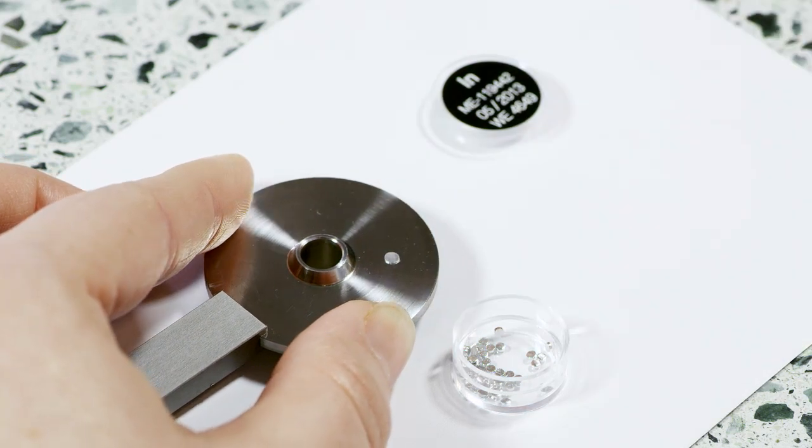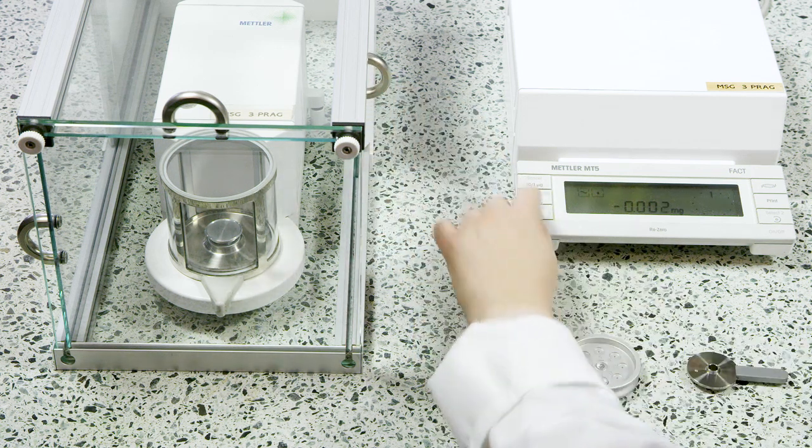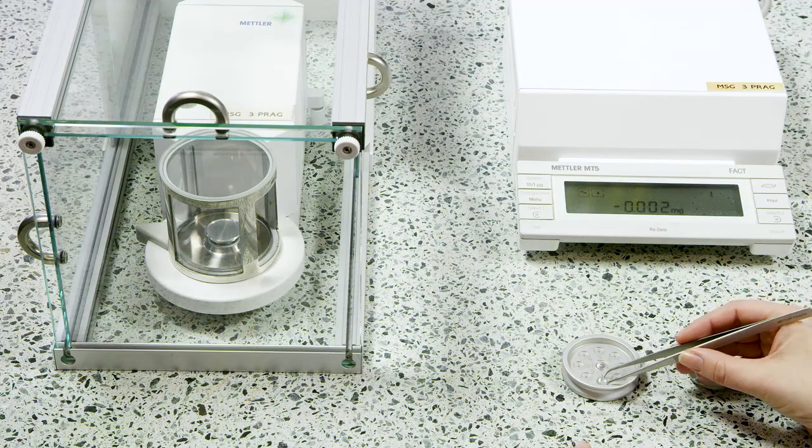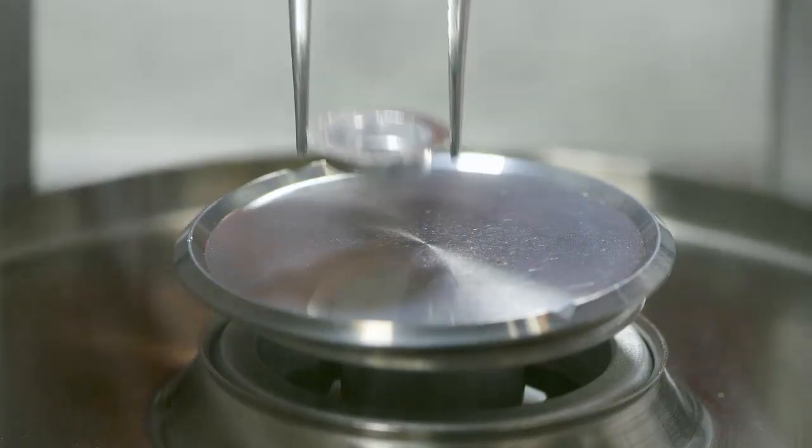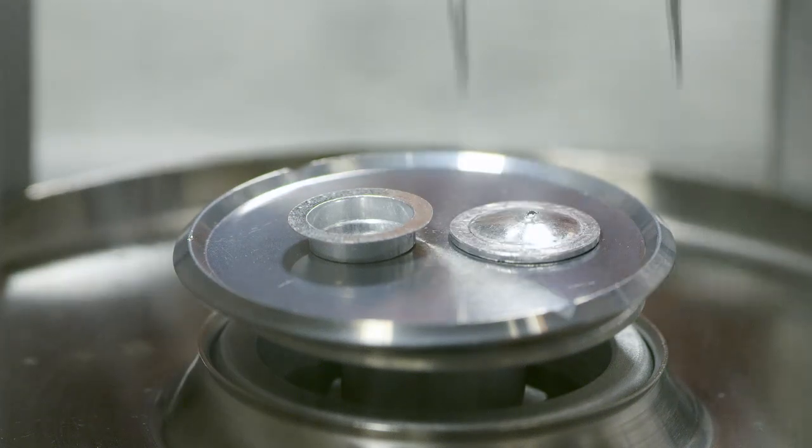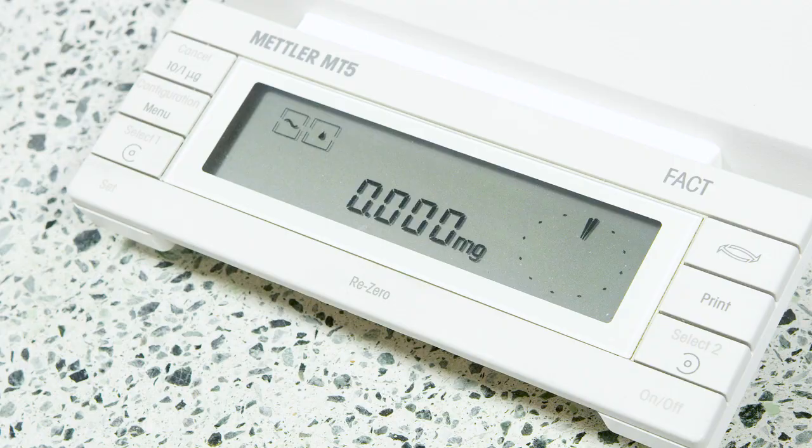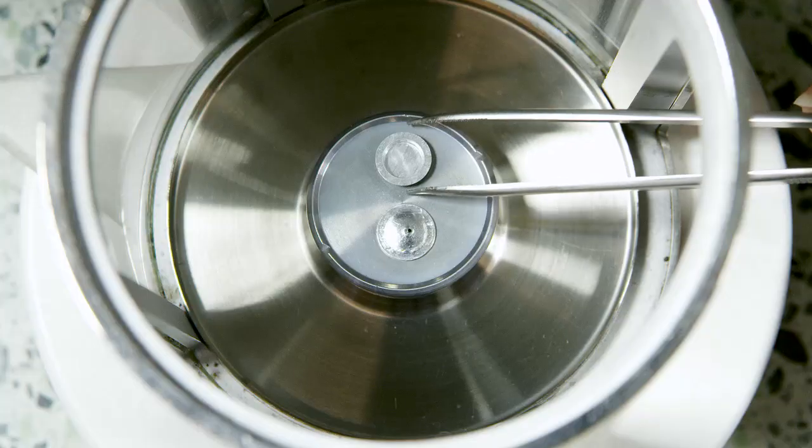For heat flow calibration, it is necessary to determine the accurate weight of the sample because the melting enthalpy taken is a value normalized by weight. Place the crucible and lid on the balance, tare, and remove the crucible and the lid from the balance.